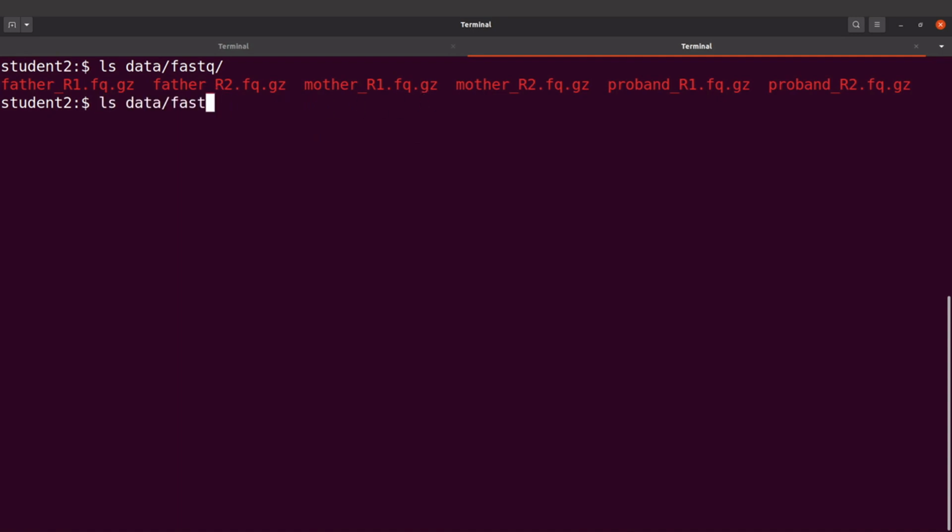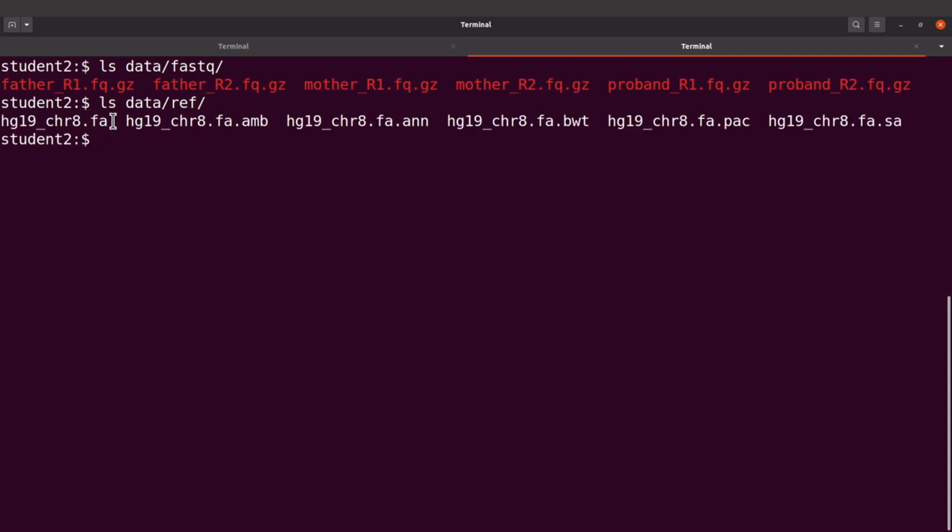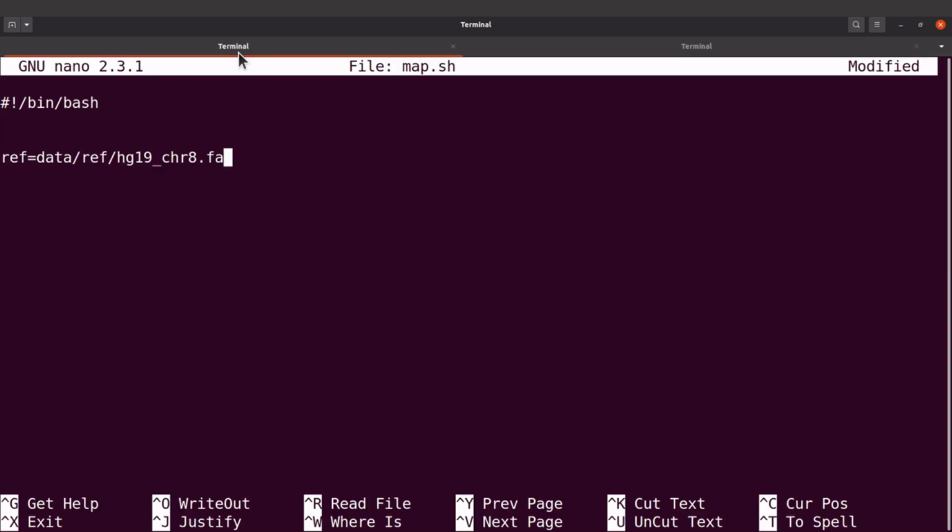So let's go into the ref directory to see. So there it is. I'll just copy it just to be sure, and then paste it here. That is the ref.